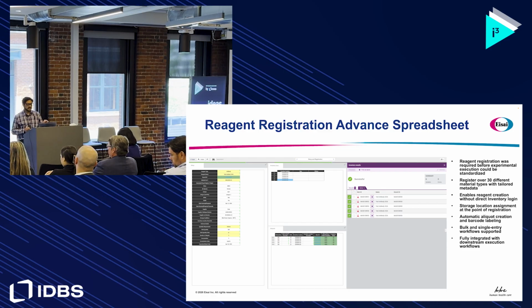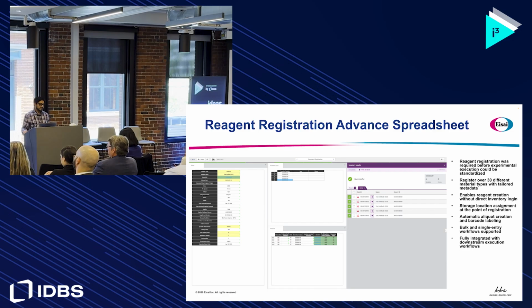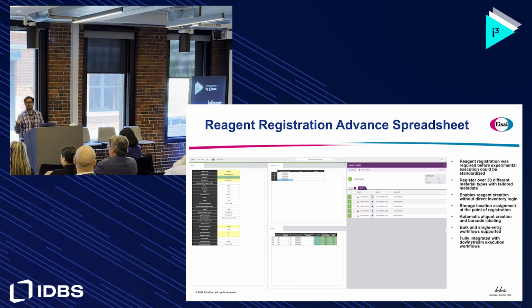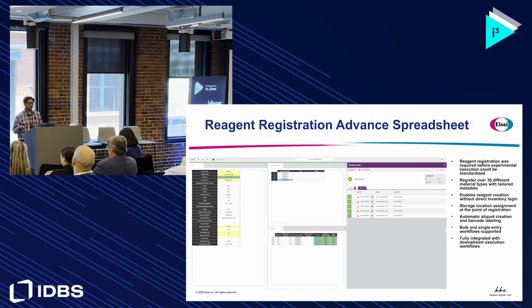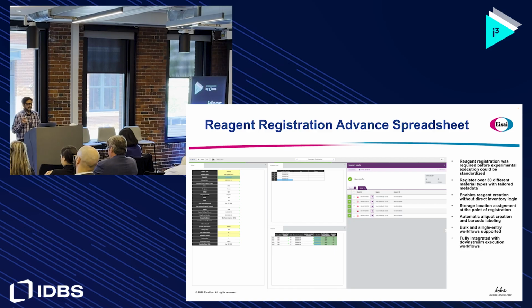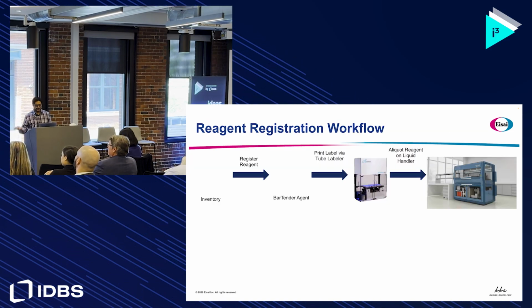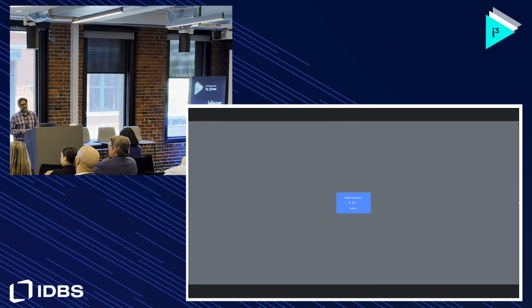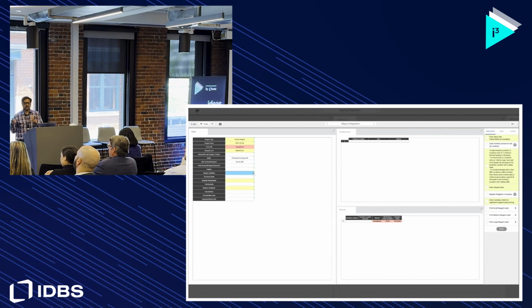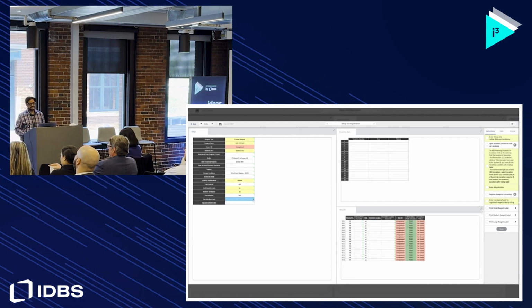Now with this template, we can do more than one reagent at a time, multiple reagent types. We have over 30 reagent types, and so it gets unwieldy, but the templates really help guide you through this and make it simple, easy, and intuitive to go through the process. But then you still actually have to do the work. You still have to generate aliquots, aliquot them out, and put them in there. So the reagent registration portion in the ELN, we took a process that took 5-10 minutes, and now it's a minute or two to just get things in there.